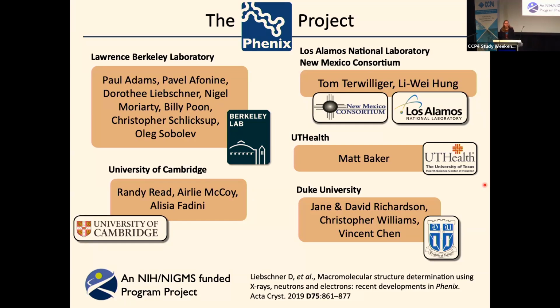Hi, Peter Smythe from the European Expo. What do AlphaFold predictions do about potential partial occupancy or multiple conformers? Can it predict those? And does that affect how well it works as an MR model? Okay, so I have a little bit of trouble understanding, so I'm just making sure I understand correctly. Can AlphaFold predict multiple conformations, and does predicting or not predicting that affect the outcome of a molecular replacement using an AlphaFold model?